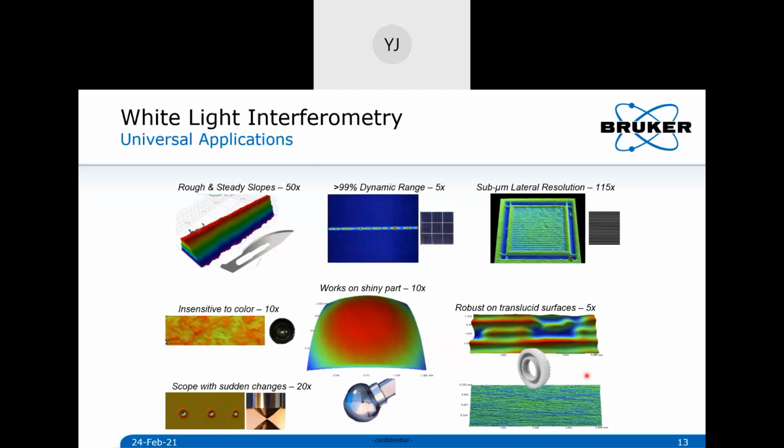And you can capture that, right? It's also insensitive to color. So you have a bright, shiny white metal against a matte black. It's insensitive, right? So you are measuring the lens, and it's almost fully black, but you can still capture it very nicely, right? So that is the main concept here I wanted to highlight.